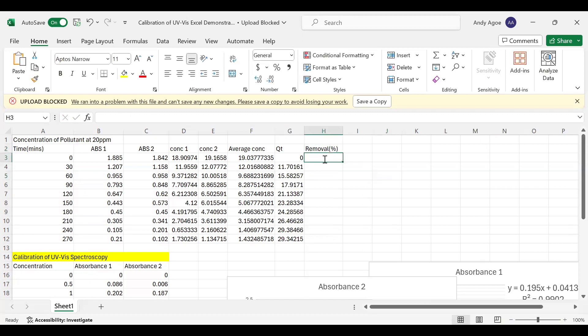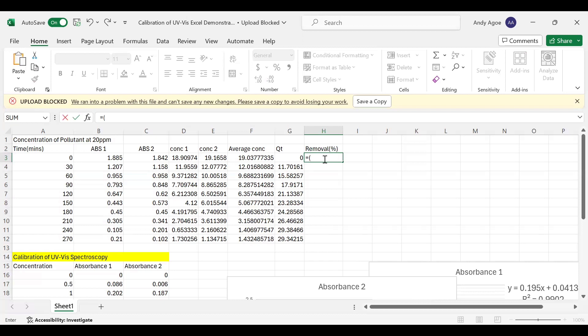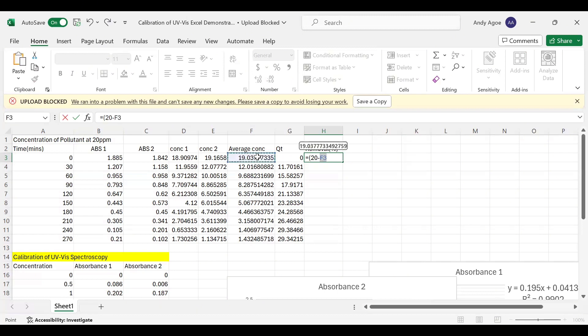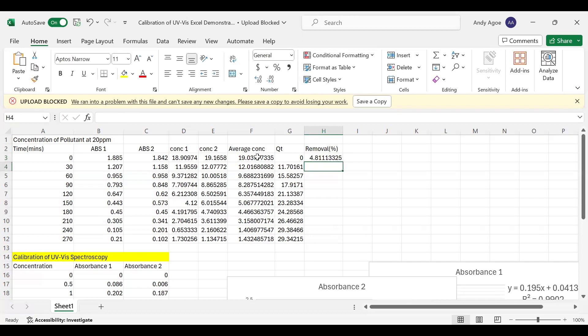Now you bring your function, the equal sign, press open bracket. The initial concentration will not be the average concentration but the exact initial concentration we prepared, which is 20 ppm. Then minus the concentration at a certain time. At T zero we have 19.03. Bring your open bracket, divide by the actual initial concentration which is 20, then multiply by 100%. Then press Enter.